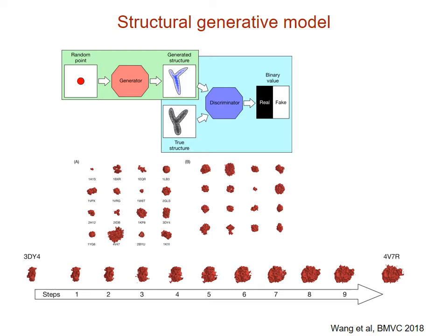Furthermore, to calculate the statistical confidence on whether two macromolecular structures are identical, we have developed a generative adversarial network-based approach to generate a distribution of randomly sampled pseudo-macromolecular structures. This work was also published at BMVC.